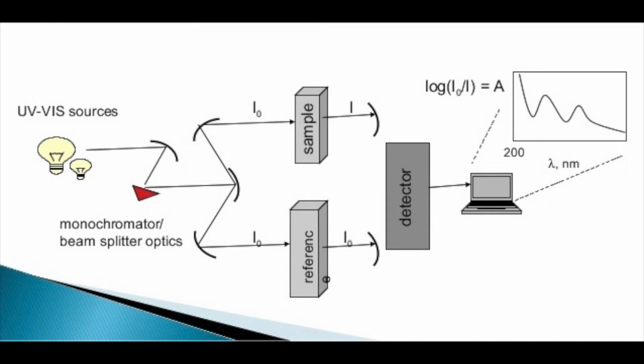Last but not least, recording devices. Most of the time, the amplifier is coupled to a pen recorder which is connected to the computer. The computer stores all the data generated and produces the spectrum of the desired compound.